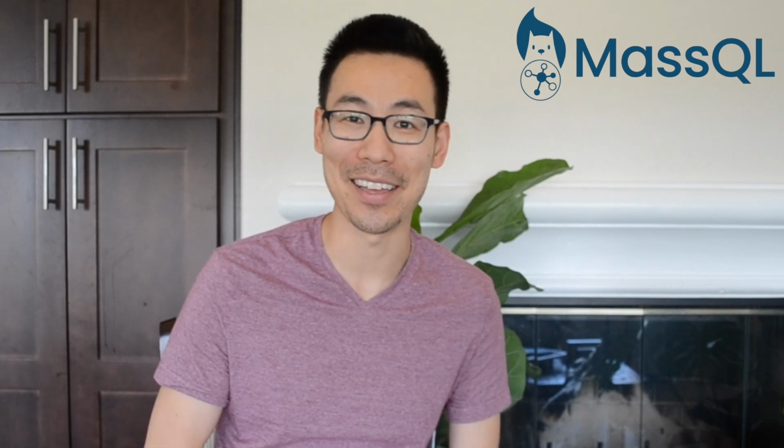I'm an assistant professor at UC Riverside, and welcome to the beginner MassQL tutorial today. We'll take you through a little bit of the reasons why we want to use MassQL, what you can start representing in the language to start looking for patterns in mass spectrometry, and take you through a few short examples on how to do the most basic queries. I'm excited to have you with us, and let's get started.